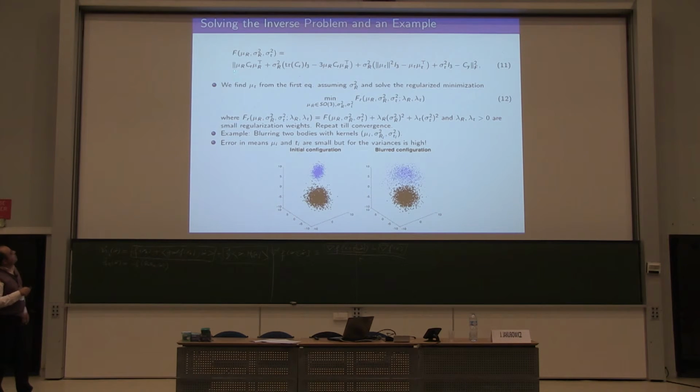Note that here you have basically an eigenvalue decomposition. The part of this problem for mu r will be eigenvalue decomposition. And that also gives some sort of indeterminacies in terms of how to select them, and then we just do some minimization to find the best selection here. So this is an example. This is the original conformation.